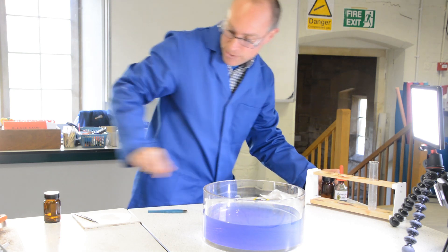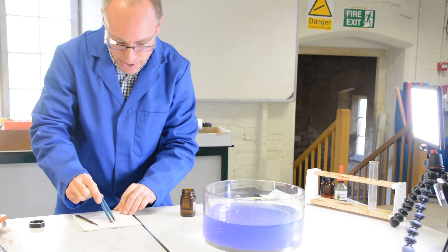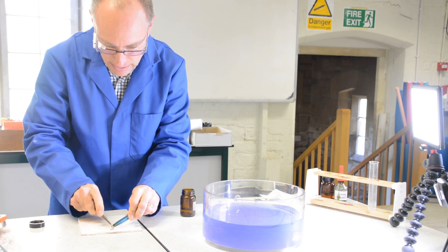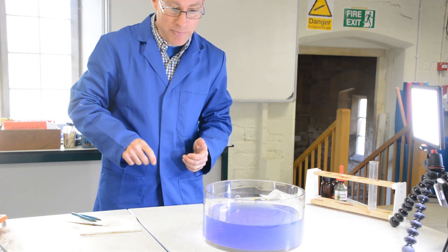The next experiment will be with sodium. Sodium is a little bit more reactive than lithium. I'll just add a piece of sodium, scrape some of the oil off it, and cut it. You'll notice it floats. The other thing you'll notice is that it melts — it gets so hot that it turns into a sphere as it moves around the surface. It's moving around a little bit faster than the lithium was. It's a little bit more reactive and will disappear more quickly than the lithium did.